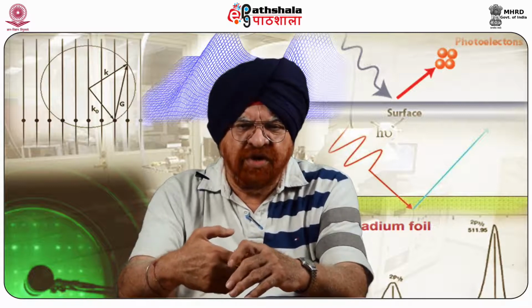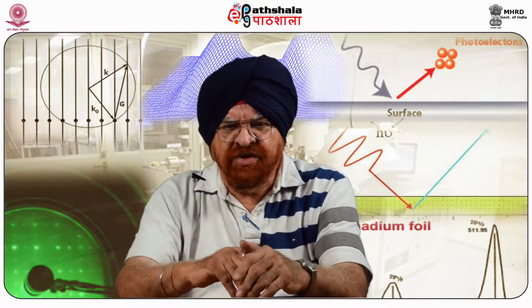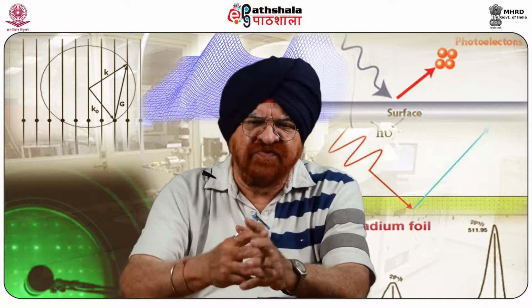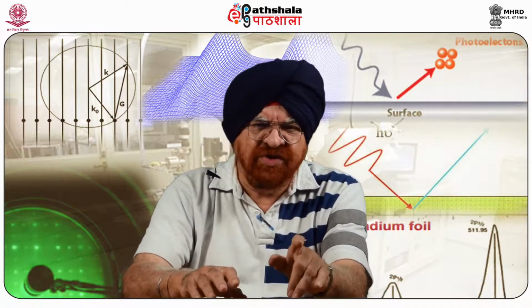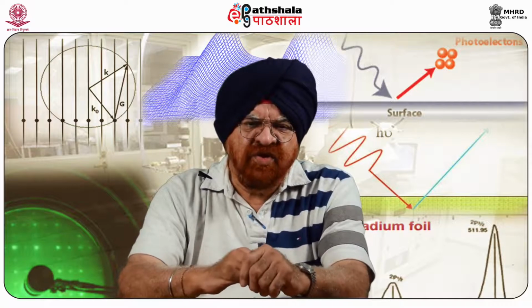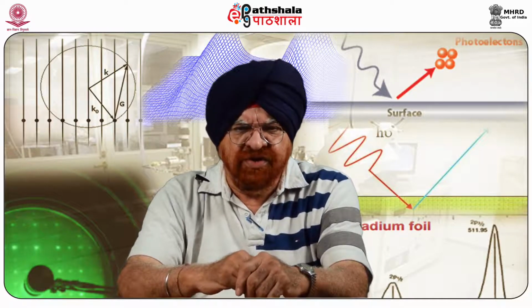Then the most important factor here is ease of interpretation. After having recorded the ESCA, the interpretation is very, very simple, and both what is there on the surface and how much is there can be very precisely answered. Now, ESCA requires very high vacuum. As we said, it is operated under UHV, ultra high vacuum, conditions.